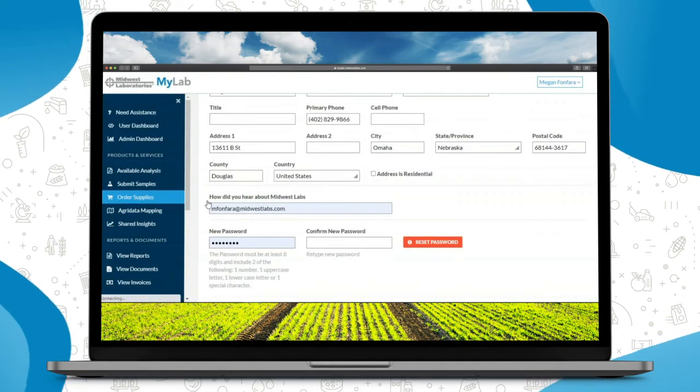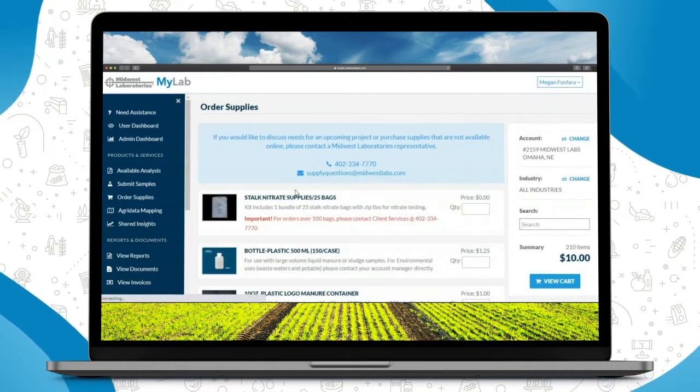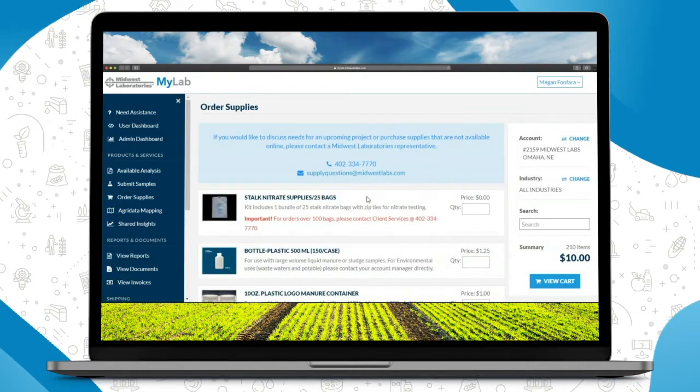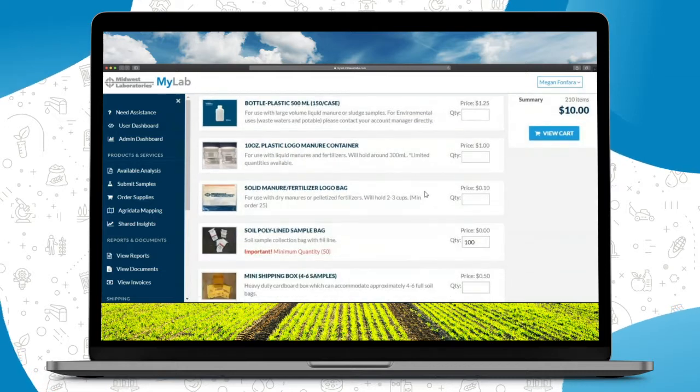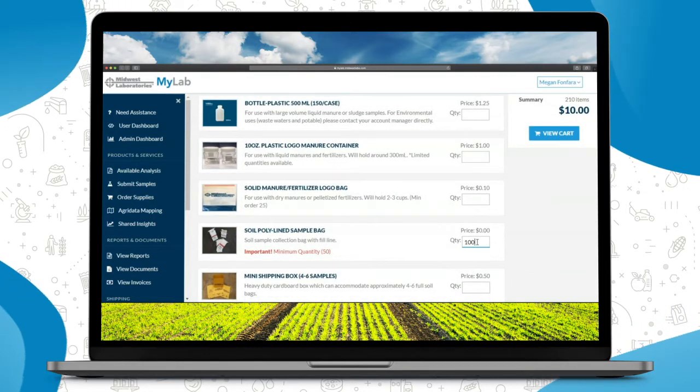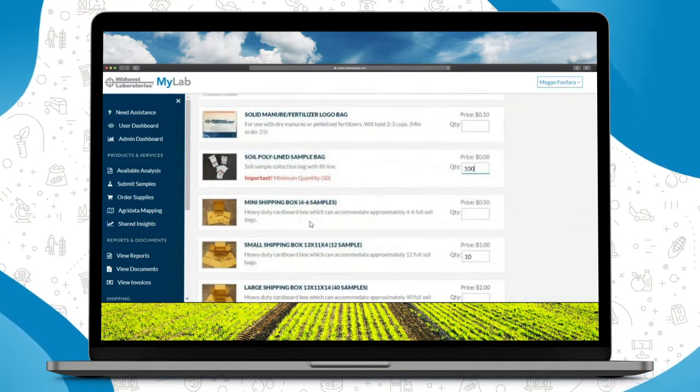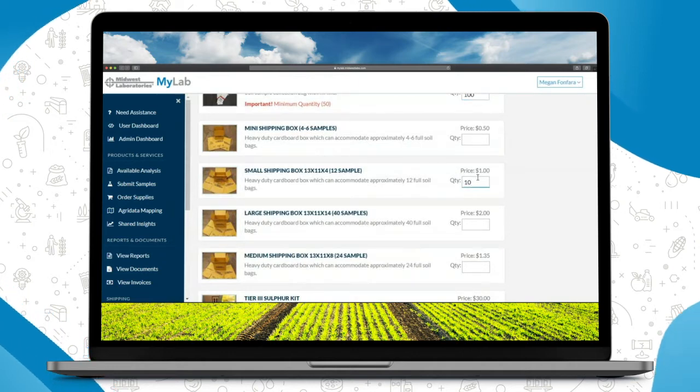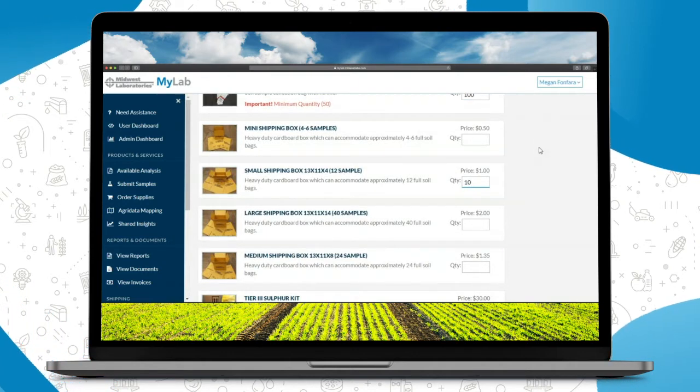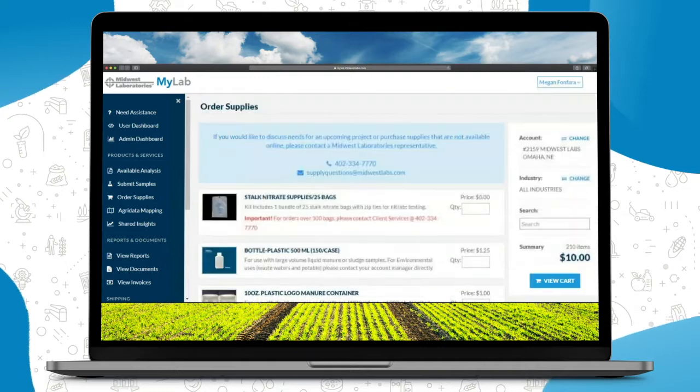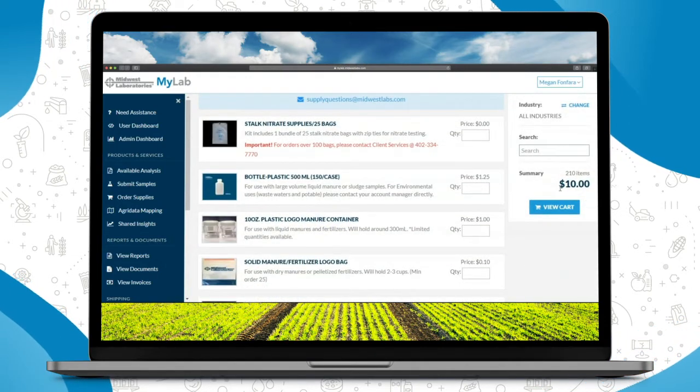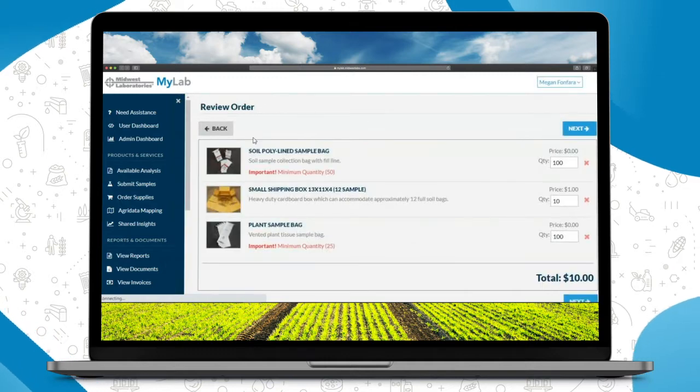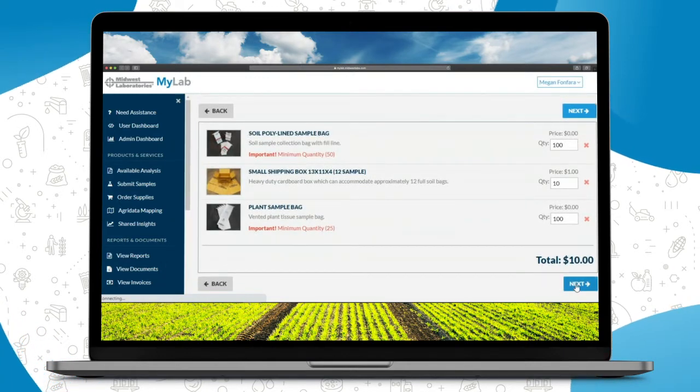A good feature here is if you're looking to order some supplies through Midwest Labs, you can click order supplies. Put in your quantities here to the right. And then up here to the top right is your summary of your items and your price, so just click view cart. Make sure everything looks good.